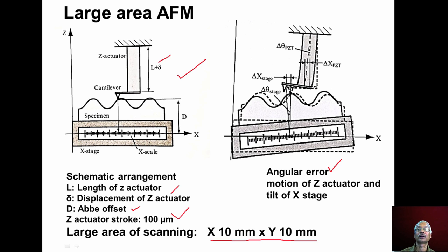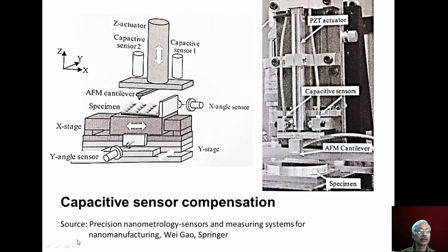There are errors in large area AFM: the z-actuator may tilt, the cantilever may also tilt, and the table can tilt along the x-axis. These angular errors affect measurement results and must be compensated using appropriate sensors. Capacitive sensors are used for compensation: two capacitive sensors compensate for the tilt of the z-actuator, while x-angle and y-angle sensors are used to compensate for tilt of the table surface.